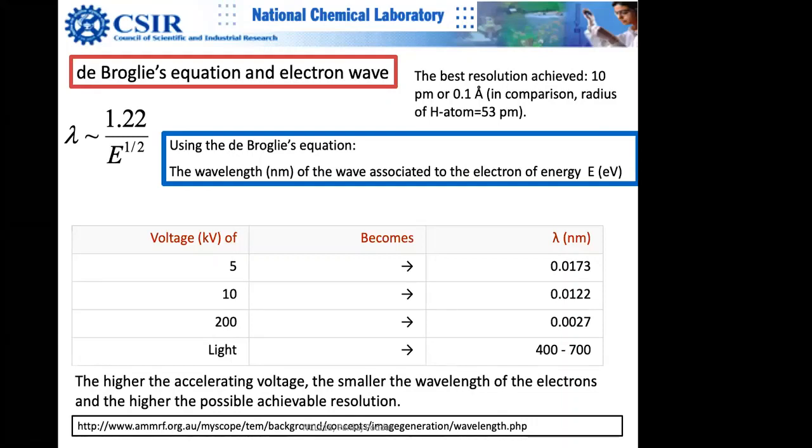To reach this kind of resolution, the electron source needs to be highly monochromatic. So there is a monochromator placed at the electron beam itself. And then there are aberration correctors in the lens part. Everything is there, and you can clean up all the aberrations in the machine.